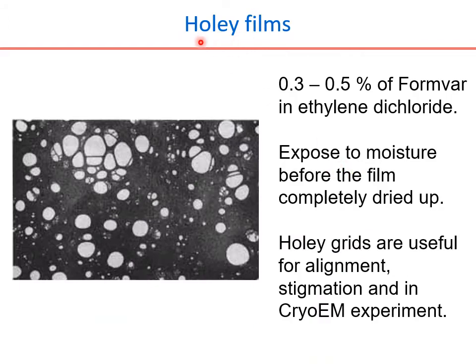By now you know that the holey films are composed of holes of irregular shapes and irregular sizes at irregular positions. So let's now discuss how to make the holey films in the laboratory. For those who don't want to strain themselves, these are available commercially. The holey films can be purchased commercially, but what I'm showing you here is a method where you can create the holey films in your laboratory by yourself.